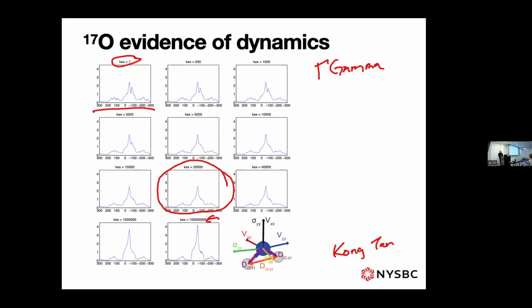being large. There was a time when I was looking at trying to measure some things in a similar sort of system between carbon and proton, but I never got the sample actually running, though it would have been interesting to look at. I bet you'd have something. I did simulations, and you can devise spin half systems where you see this effect as well. That's a really good point.